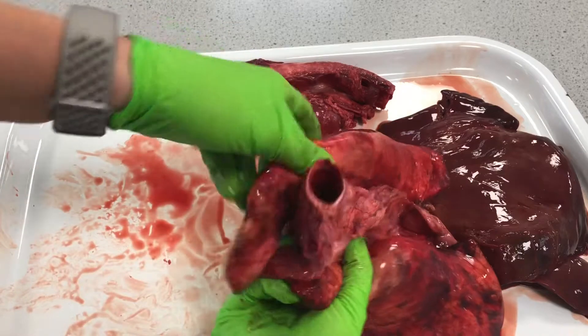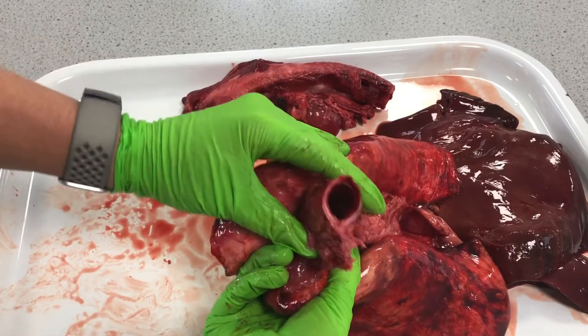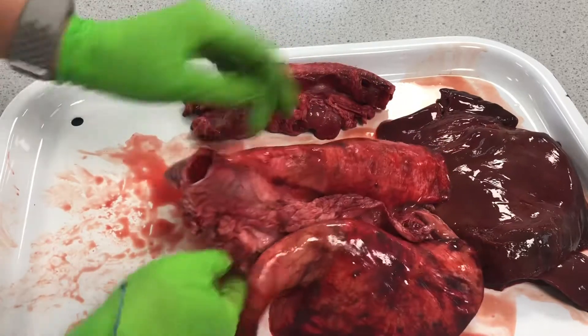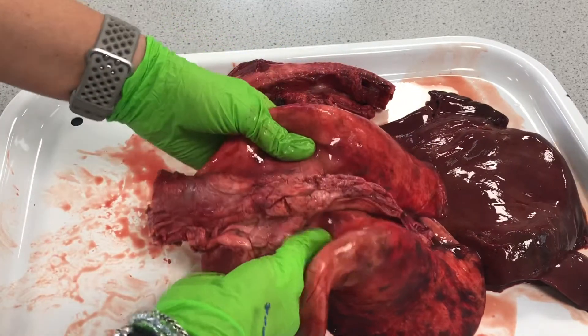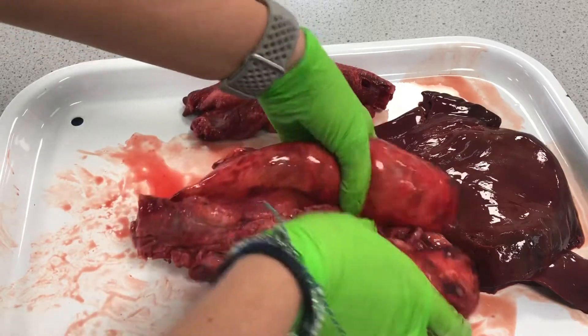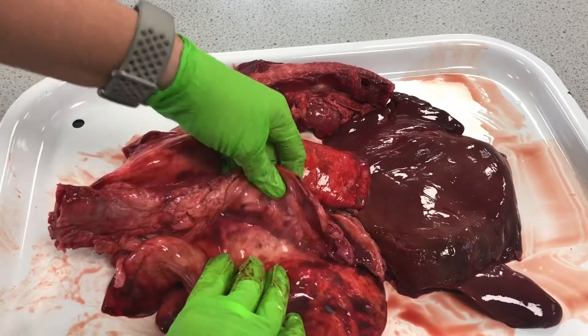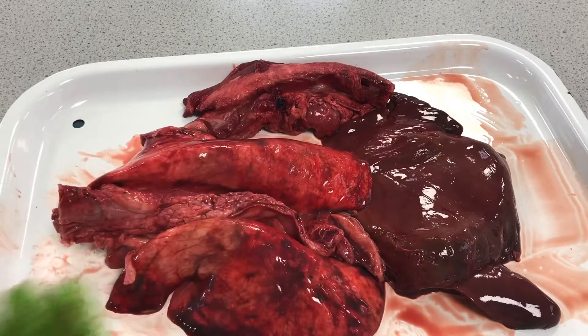If we look down into the lungs, we can see the trachea, and that breaks off into the two bronchi further down, just where my fingers are now. We're going to have a go at trying to inflate these lungs — can't promise it's going to work, but we'll give it our best shot, and then we'll do a bit more dissection of the lungs.